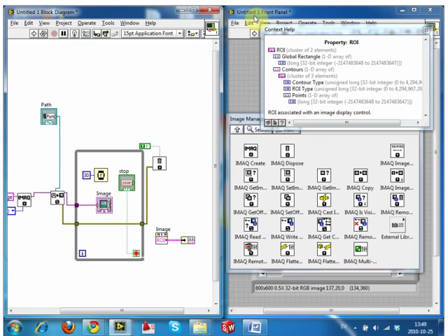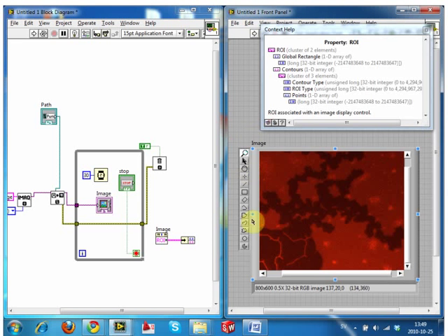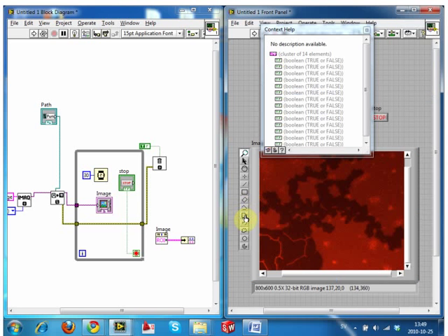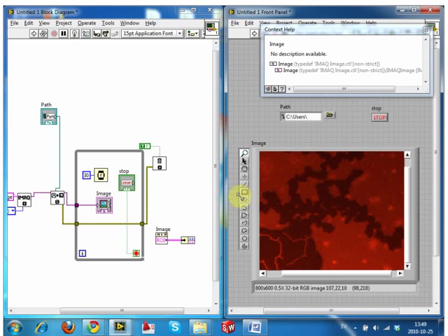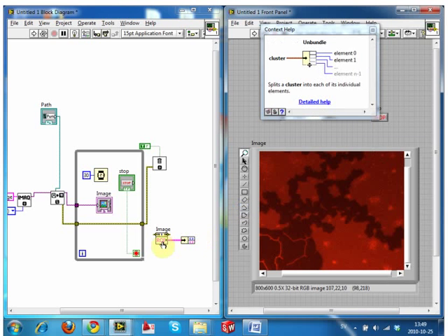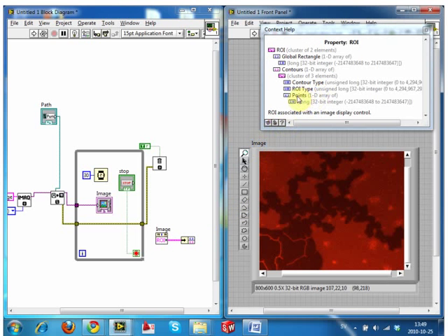The rectangle information that it gets out is essentially the four corners of the region of interest. If that region of interest was some wacky, multiple shape thing, it would essentially still give just the four corners, unless you went into the contours and picked out every single point. So if we go over to here, you'd be able to see that there is an option to pull out all points. For things where you've drawn some wacky shape, you have to pull out the points, unless you just want the outer box, then you can use rectangle. But if you want all of the individual points, you have to pull out all of the data points individually.